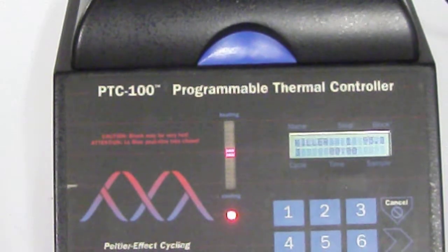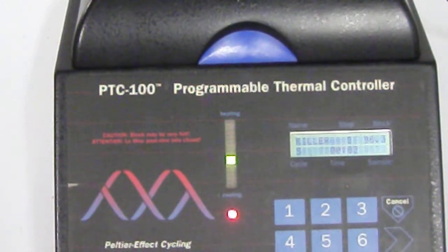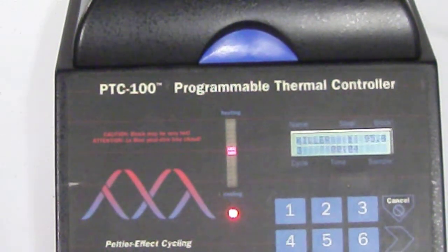This Cycler comes refurbished with calibration report and a 90-day parts and labor warranty.